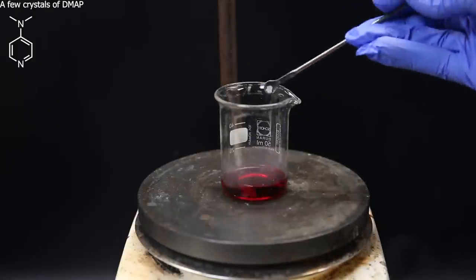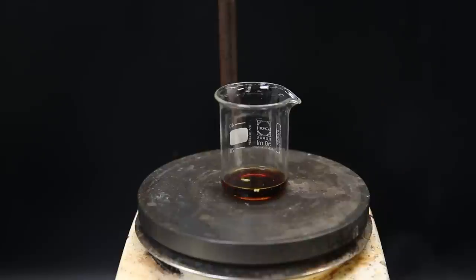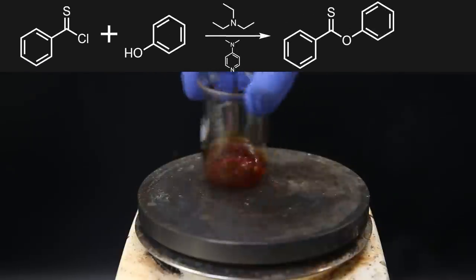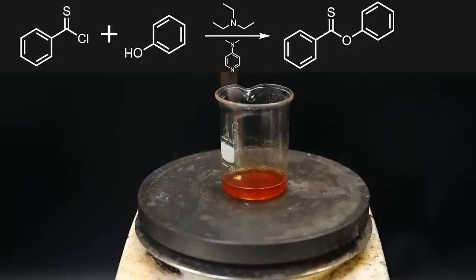Then as the final ingredient, which will catalyze this reaction, a little bit of DMAP. Within a few minutes, the mixture turns orange. In the reaction, thiobenzoyl chloride will react with phenol, to form the corresponding thionoester, which can be purified by column chromatography.